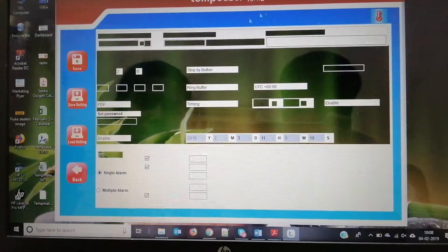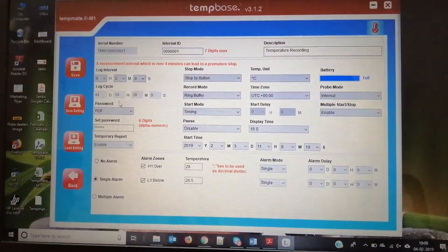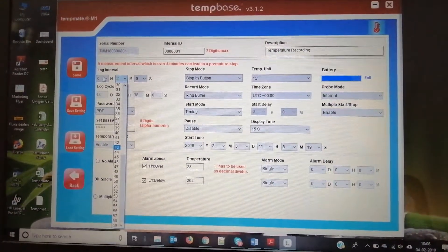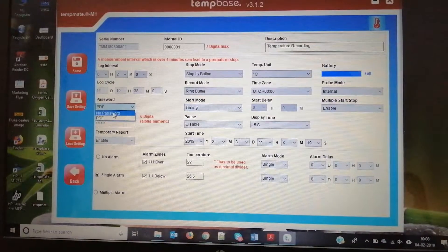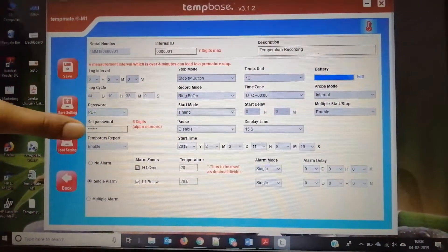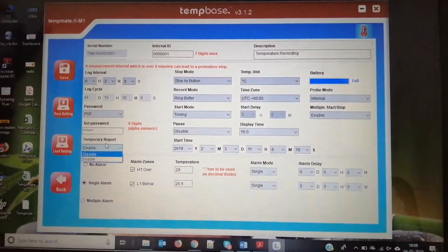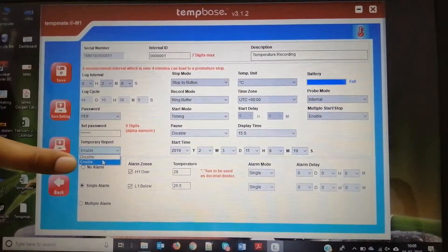Now I'm setting the parameters. This is the display to set the parameters. Here you can set the log interval in minutes, hours, or seconds. Here you can set a password if you want — if you don't want a password, you click no password. You can set the password as needed.